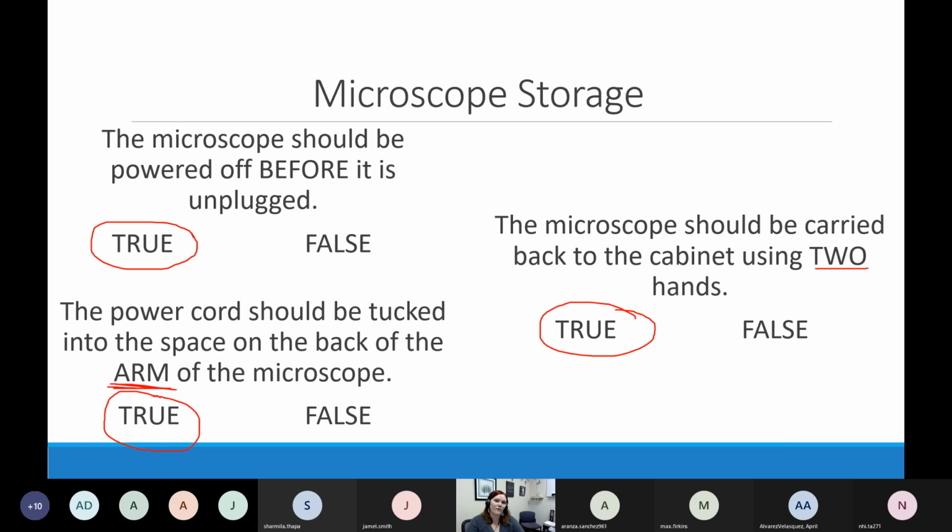So we don't have 100 times on our microscopes in the anatomy lab, but you definitely do in the microbiology labs and some of our general biology labs as well. So it's out there. It's just not within the scope of our class. But great question. I do love that virtual microscope. It's fun to play around with.